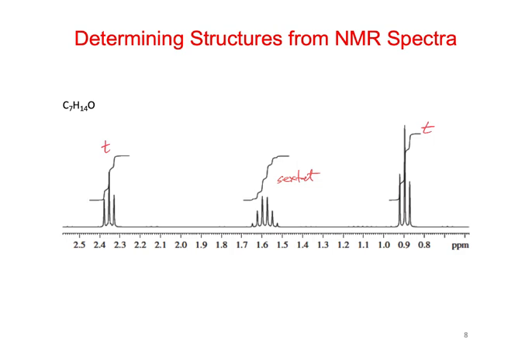Yeah, but because the fact that there's 7 carbons means that. Well, the triplets are really big. You got a lot of protons on them, but they have the same shifts. Right, what about the integrations? They're 2, 2, 3. Yeah, that's what I would say too, right? 2, 2, 3. Right? So we have two triplets.